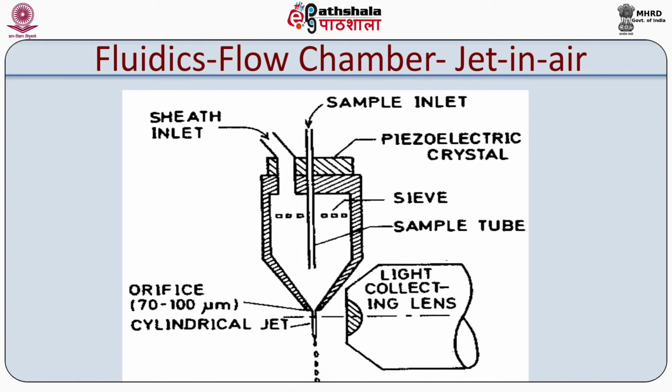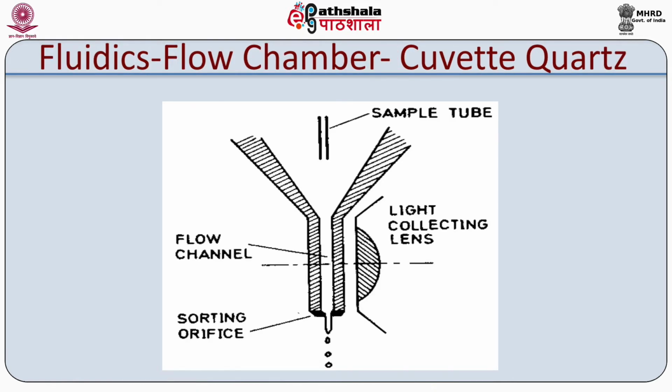Misalignment of the laser beam with the stream can result in uneven illumination of the particles and increased variability in the signals emitted. And this results in decreased precision. Most benchtop cytometers have a fixed sample pressure setting, which means fixed alignment, and the sample stream is pressurized upward through an optically clear region of the flow cell or cuvette. Particles pass through the laser beam while they are still inside the flow cell.